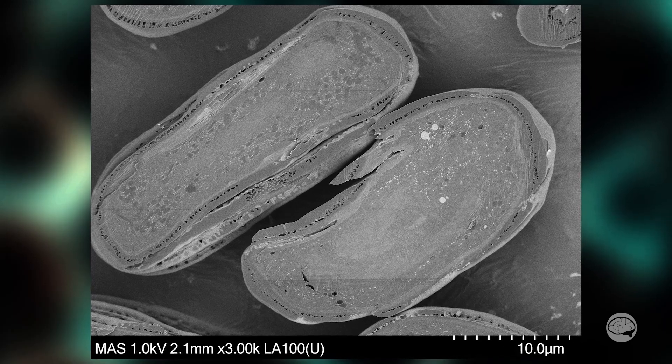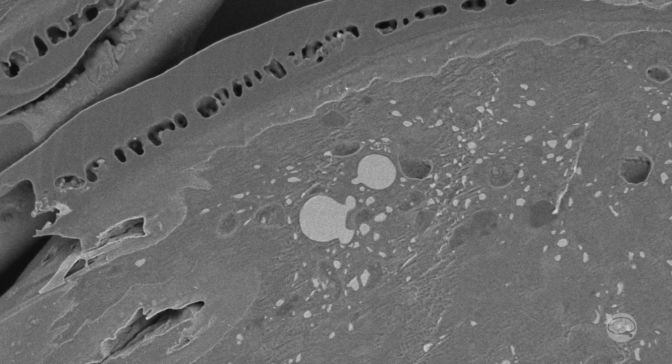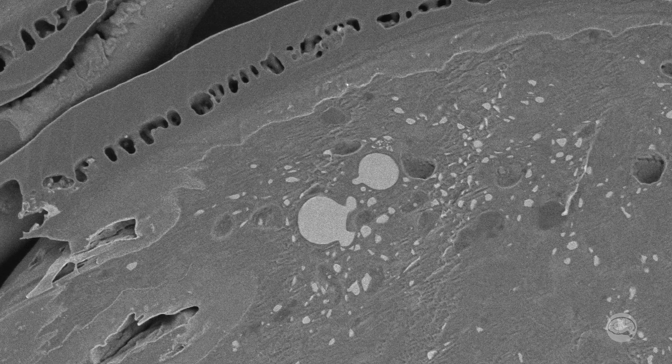So what are these structures? I don't know — I'm not a botanist, get off my back. But if we look around a bit more, I saw these other structures: these lighter-colored spheres. Well, that's different — I wonder what they could be.